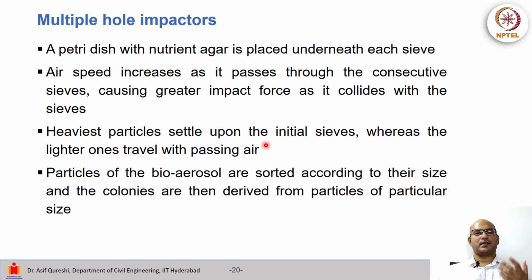Immediately they will settle as soon as they enter. The lighter particles will probably pass through the first sieve. So lighter ones will travel along with the passing air, and they may settle in the subsequent sieves.